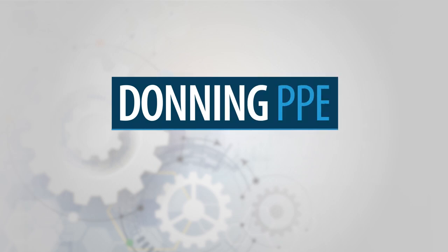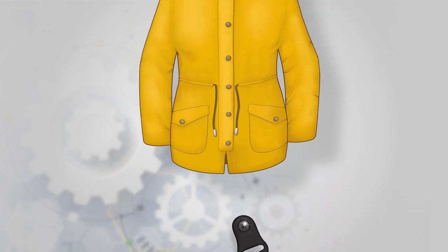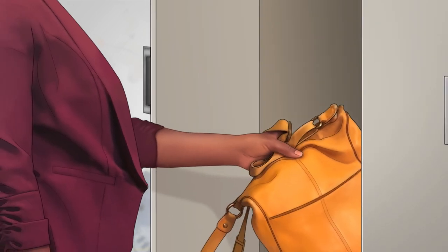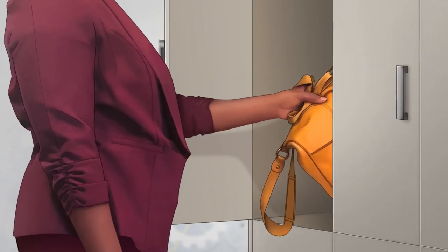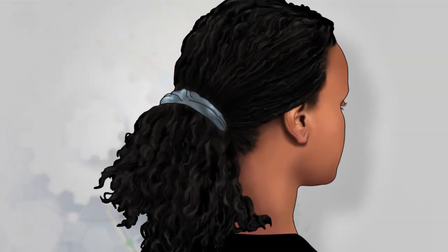The first step is to remove personal items such as jewelry, watches, coats, jackets, cell phones, pens, or additional bags and place them in a location outside of the laboratory. Then, tie back any long hair if present.